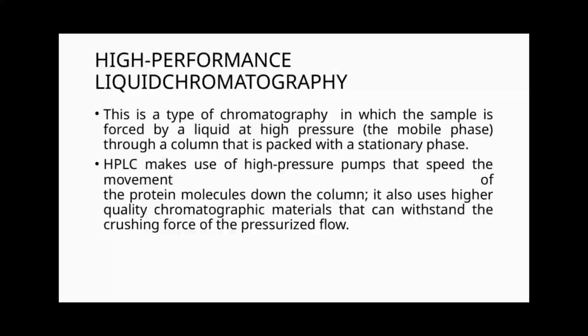These pumps accelerate the movement of protein molecules down the column, making the process much faster and more efficient than traditional chromatography methods. Additionally, HPLC utilizes higher-quality chromatographic materials that can withstand the crushing force generated by this pressurized flow. So, in summary, HPLC is a powerful technique that combines high pressure, advanced materials, and precise control to achieve rapid and effective separation of complex mixtures.